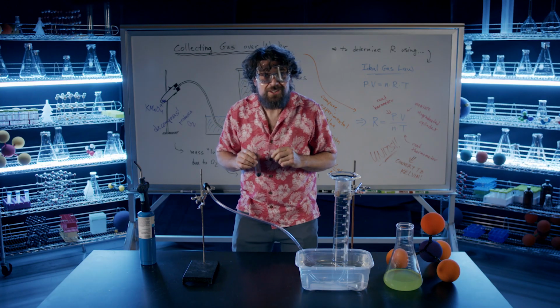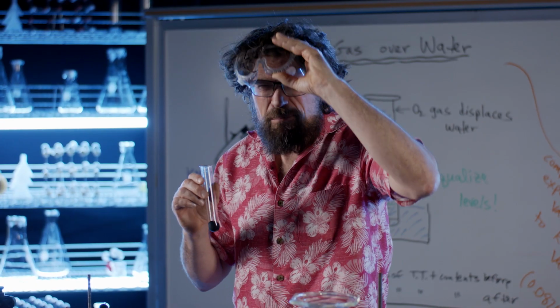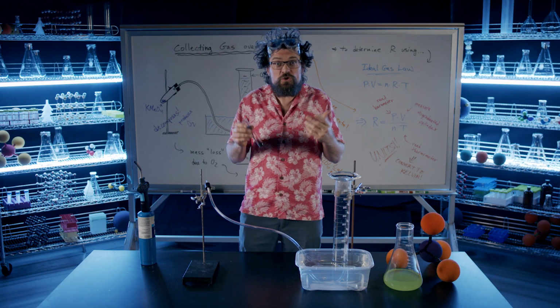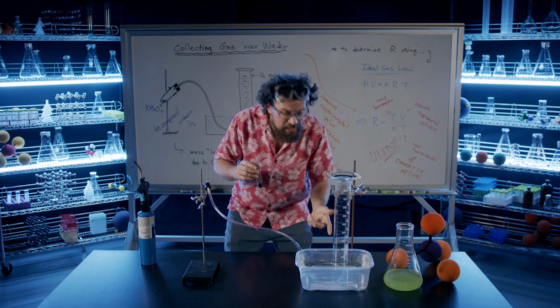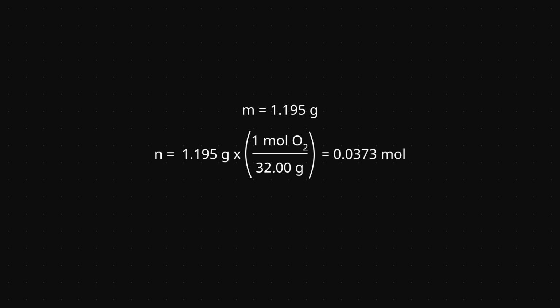We weighed the test tube before and after the experiment. We lost 1.195 grams. The decrease in mass is due to the oxygen that we lost from heating the test tube, and we collected it in the cylinder. The moles of oxygen is therefore 0.0373.